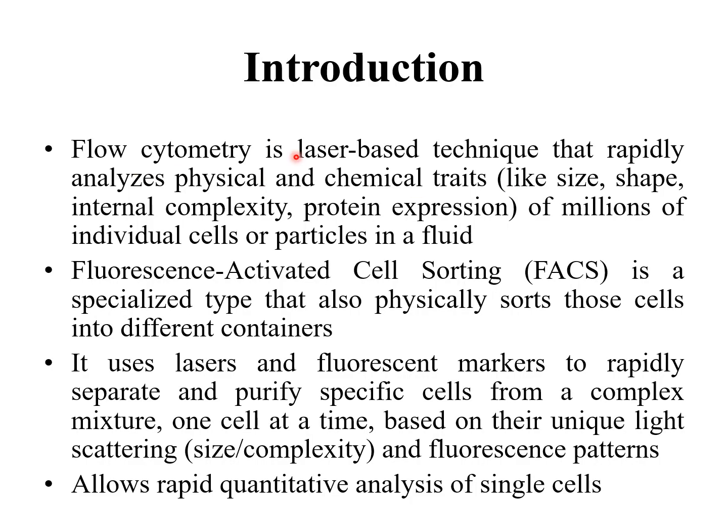Flow cytometry is a laser-based technique that analyzes physical and chemical traits of cells like size, shape, internal complexity and protein expression. Fluorescence activated cell sorting is a specialized type that also physically sorts those cells into different containers.